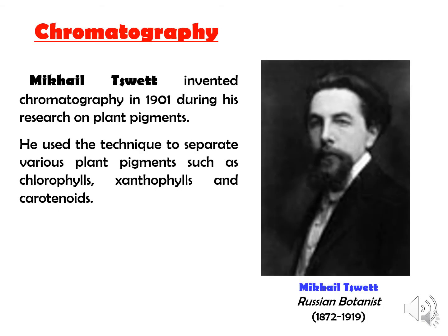Okay, so just real quick here, start out simply. Chromatography was invented by Mikhail Tswett in 1901. He was a Russian botanist, and he was trying to clean up some plant material, took the ground up plant material and tried to wash it through some sand with water.